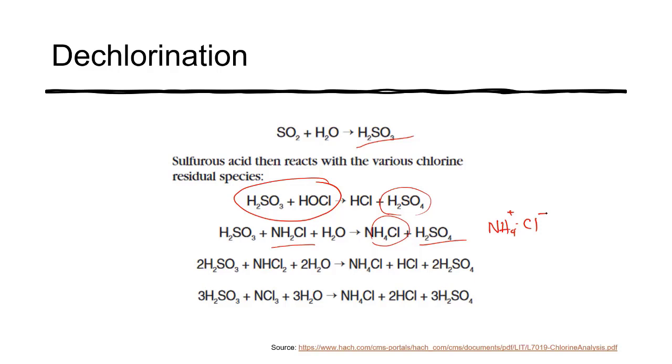The major thing that we're using it for is because we do not want to release water that contains chlorine or hypochlorous acid or hypochlorite. These are various forms that occur in water. But we don't want to release that to the natural environment because we don't want to disinfect the stream.